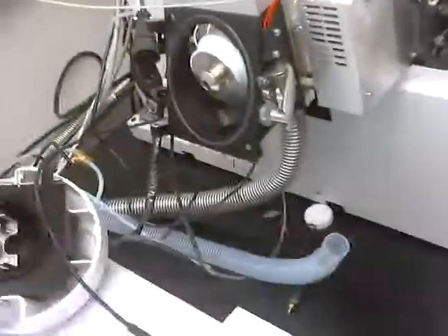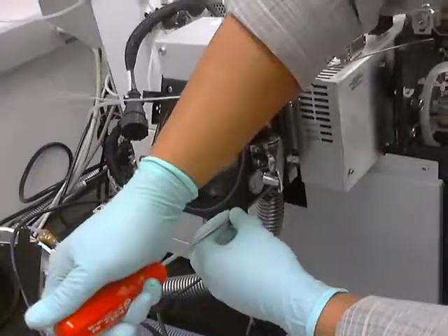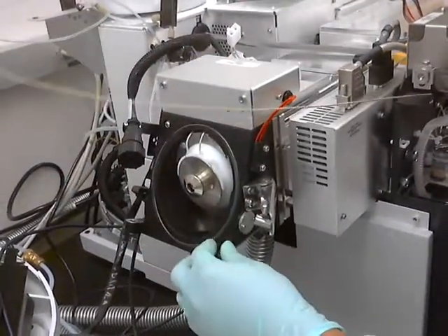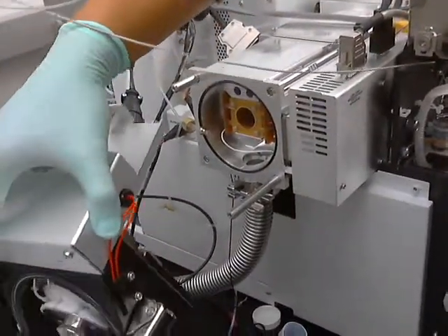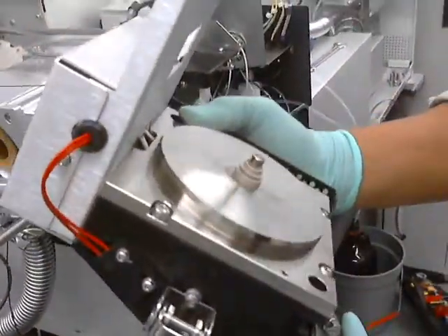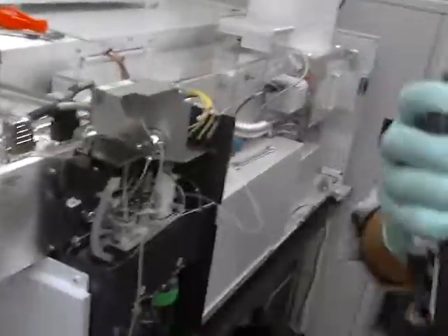Now we'll be able to take this off — two screws: one, two. So that's the desolvation chamber there. I'm going to look inside here — it's not too bad. That's the capillary. So the desolvation chamber can go over here.